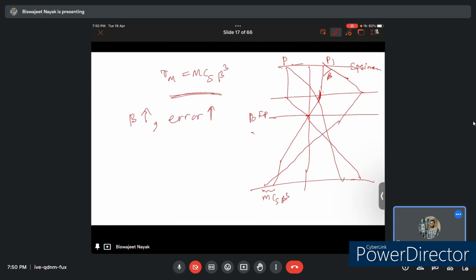Here the error increases as beta increases, so it's larger for a larger Bragg angle, or for large g, which is the reciprocal lattice vector which we have considered.